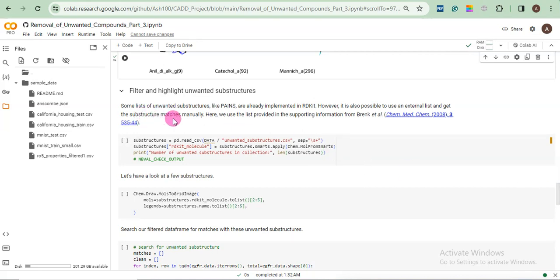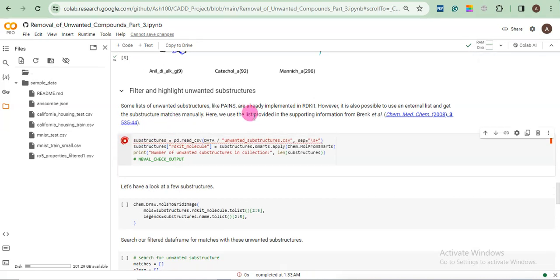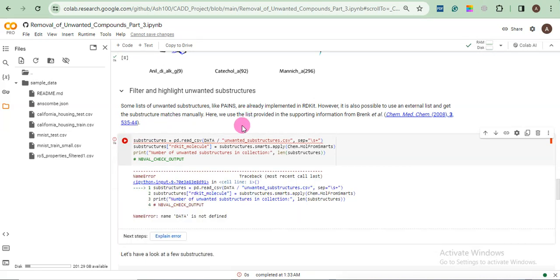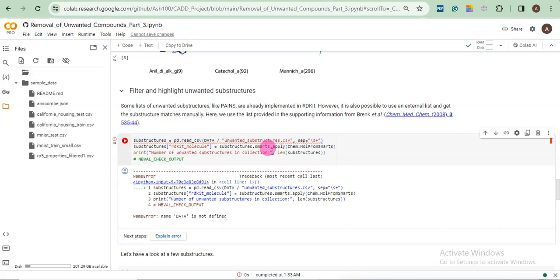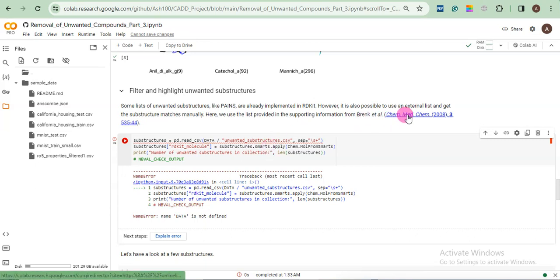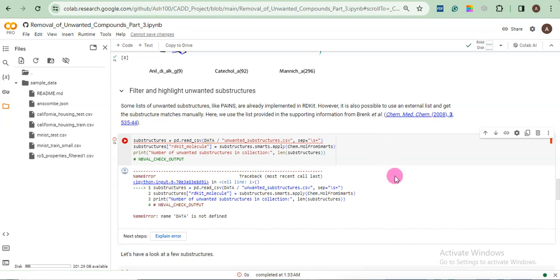Now we will do some filtration for the unwanted substructures I explained above. Now let's run this cell. Okay, wait. We have some error. Let me fix it. Okay. The error says that name data is not defined. You can see here. It says data and here some file. So the computer or the script cannot find this file. So what I did, you can also find this data from this article. Otherwise, I will provide the list of these unwanted structures.